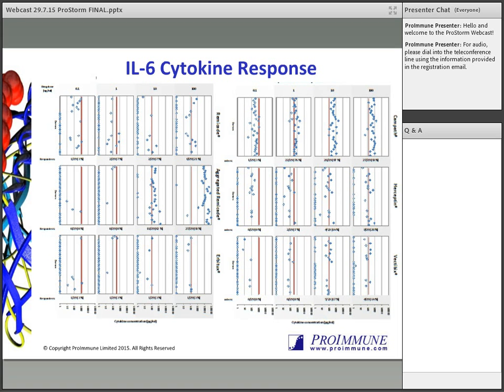The data is also presented in the report with the mean value for each concentration for each drug. So here again you can see a very nice dose response in Campath with the mean levels indicated by the red dash, and also elevated levels of IL-6 for aggregated Remicade at the 2 highest concentrations, which is very comparable to our positive control, the staph toxin.